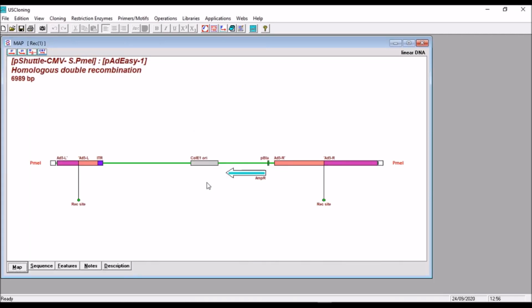Third, this is one of the recombinants. As you can see, the process of recombination took place here in the middle of the sequence. Since we have colored the sequence in different colors, here are the different colors of the new sequence.